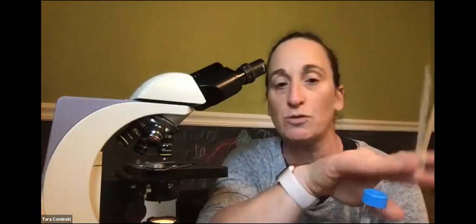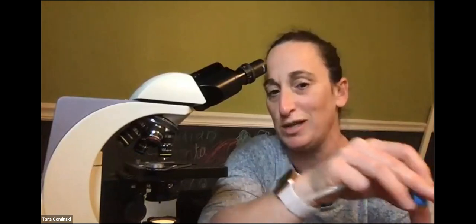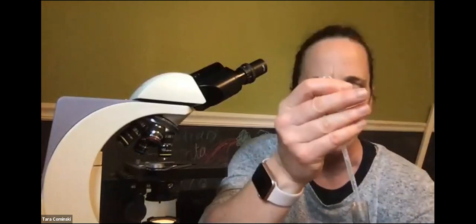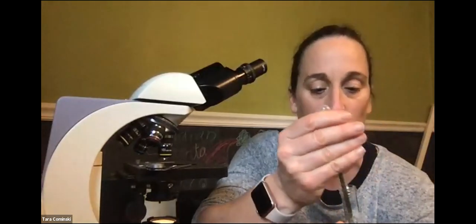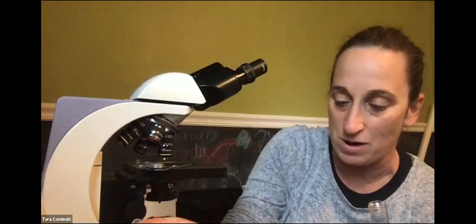So you can use methylene blue. That's just a dye, a stain, right? A general stain. You also can use iodine. I have bromothymol blue, which probably is not going to work because this is really like a pH indicator. Not really sure. I just must have grabbed the wrong tube. I was wondering why it looked kind of funny, but now I know why. So let's just see. It might work.